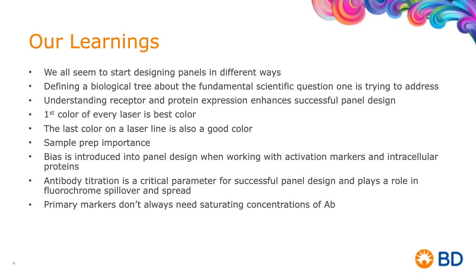And what we do know in our field is that not all colors work in intracellular applications. So that being the case, we have to save those colors to put them on the intracellular ones first, and then we have to work without some of those good colors for all of the other cell surface receptors.